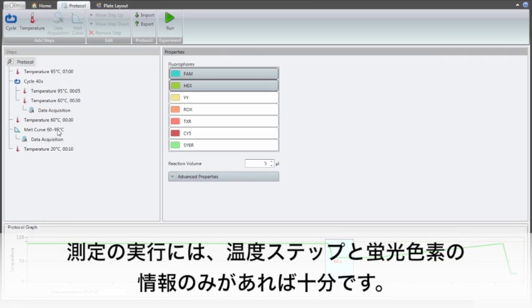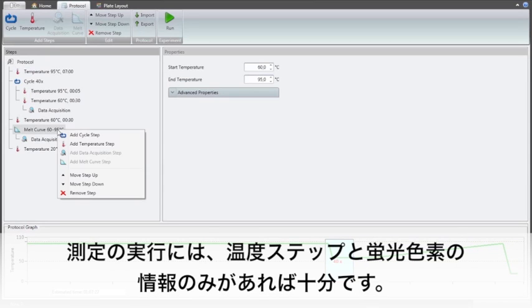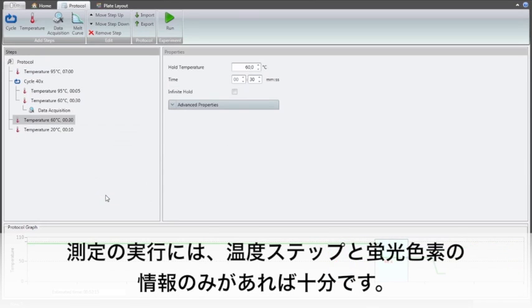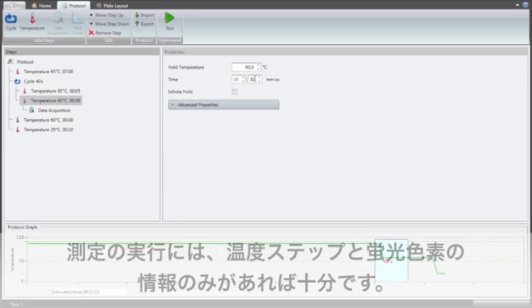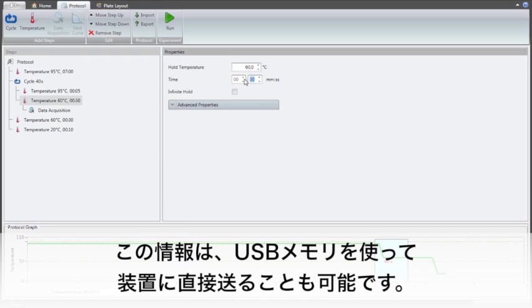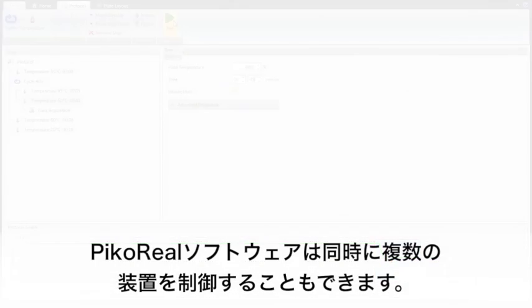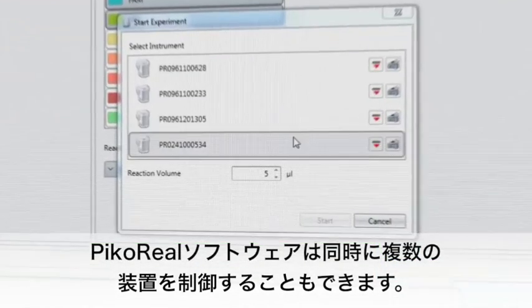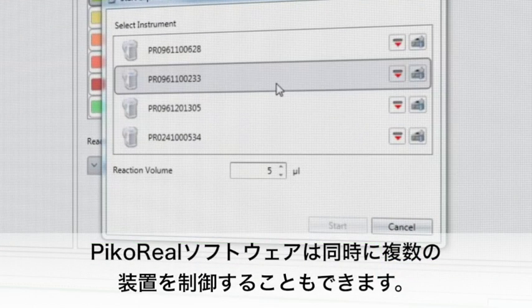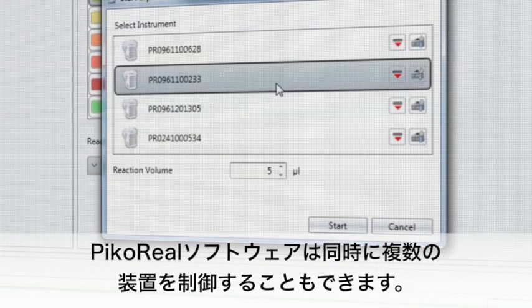Before starting a run, the instrument needs no more than information on the temperature steps and fluorophores to be measured. This information can also be given to the instrument using a USB stick. The PicoReal software can control and run several instruments at the same time.